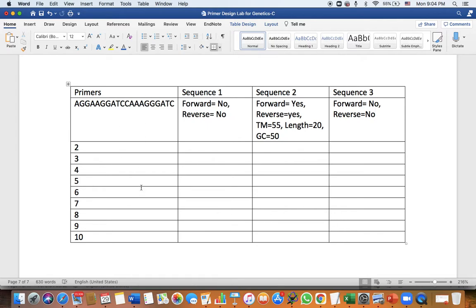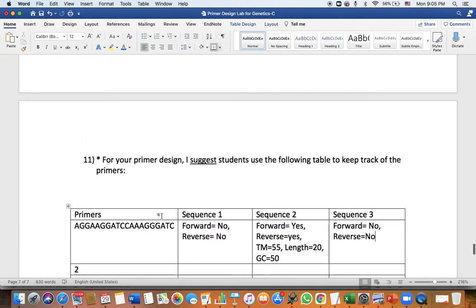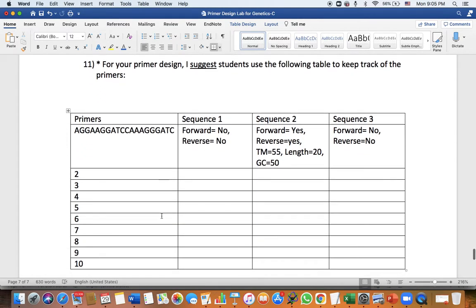A good primer, or the correct primer, will have all of the sequences having forward, and all of the sequences will have reverse for a good reverse primer. So it's either a good forward primer or a good reverse primer for these specific primers that we have here, right? So let's look at some other things about APE.